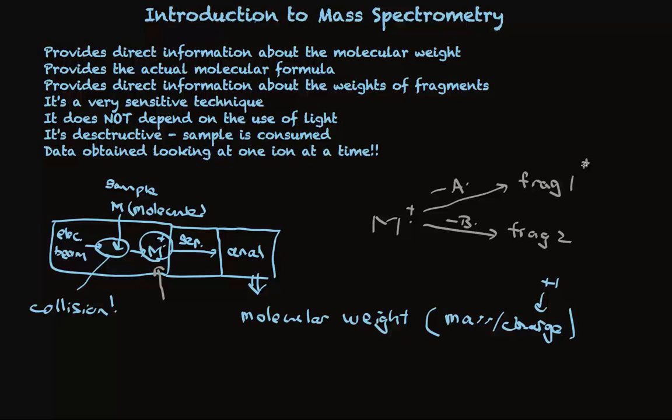These are positively charged, and because the bonds have been broken to lose radicals, they are no longer radical cations. They are simply cations like carbocations. And a third, to make fragment 3. You get the point. A variety of bonds in the molecule may be broken as a result of that excess kinetic energy.